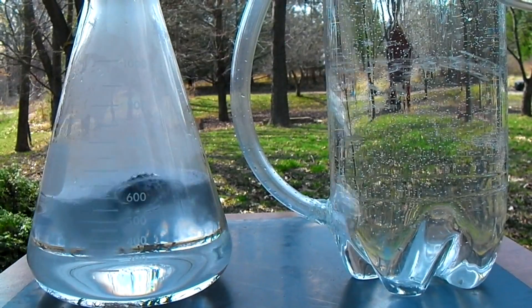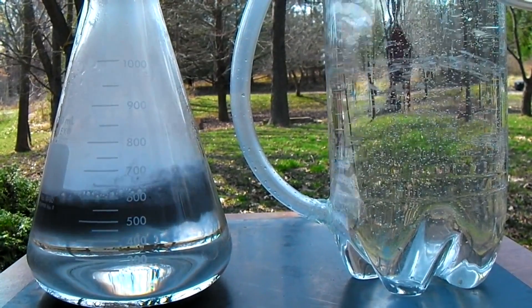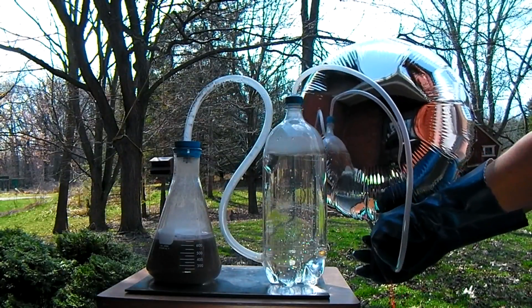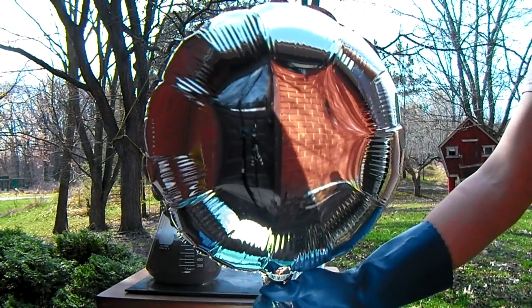Bubbling the hydrogen through water cleans the gas and removes impurities and acid vapor that would otherwise be present without this step. Once through the water, the clean hydrogen is then fed into the ¼ inch vinyl tubing and from there can be filled into balloons or any other container it is to be held in.